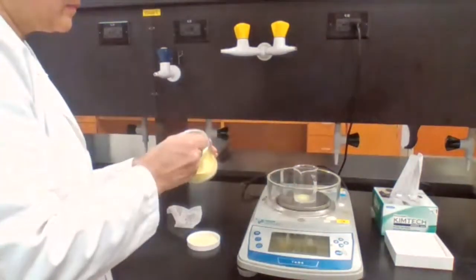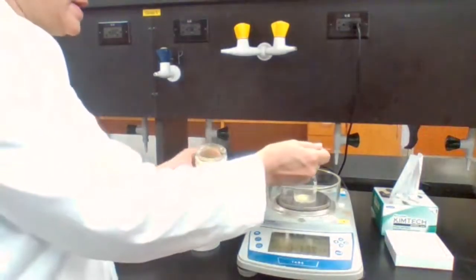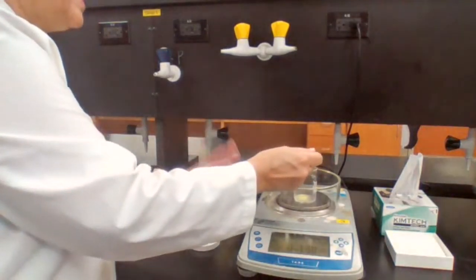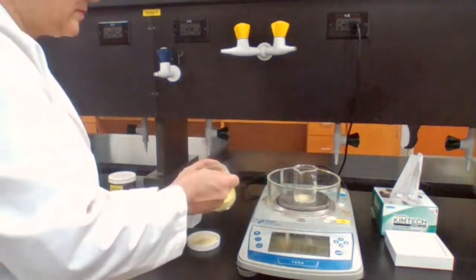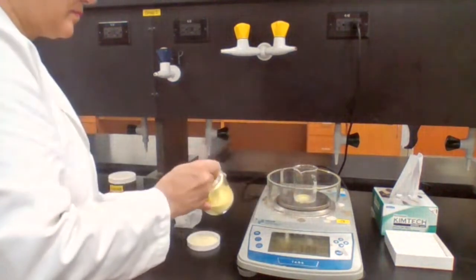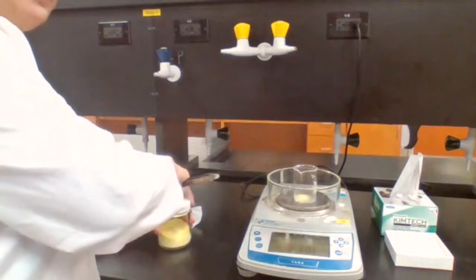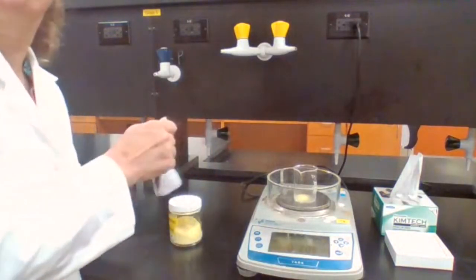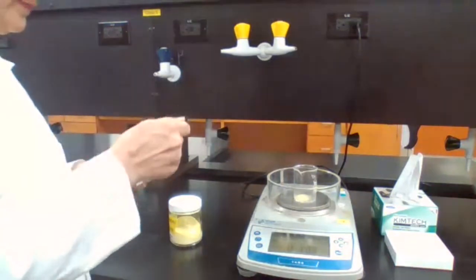It's working. Well, it's not on, I turned it off, but it's working. Thank you. Okay, 0.2 grams. Exactly 0.2 gram is measured. And then we are going to dissolve it in toluene.